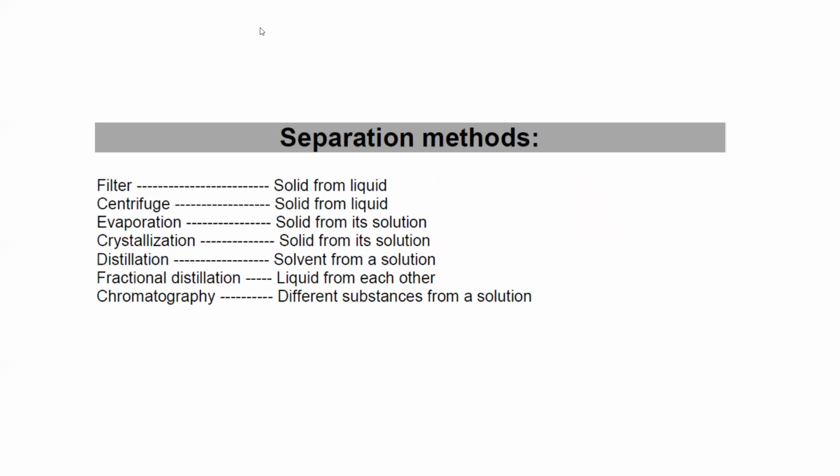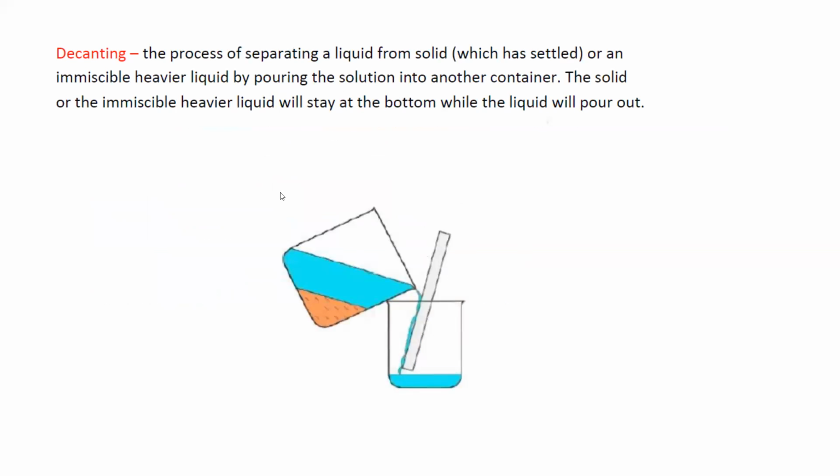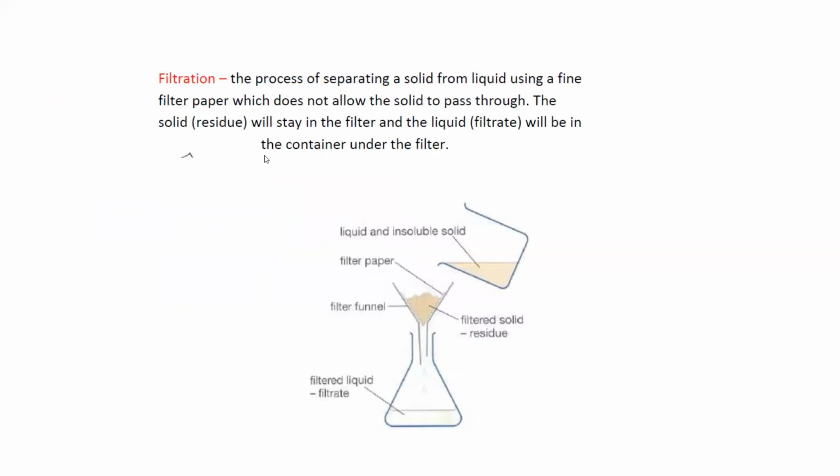The first one is filtration. This technique is used to separate an insoluble solute from the solvent. If we have an insoluble solute and we want to separate it from the solvent, we can use filtration.